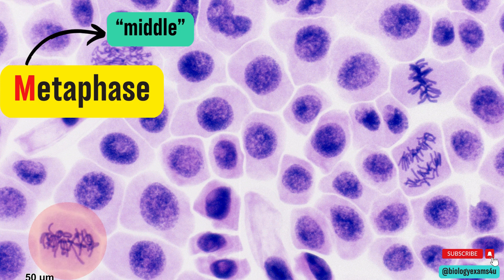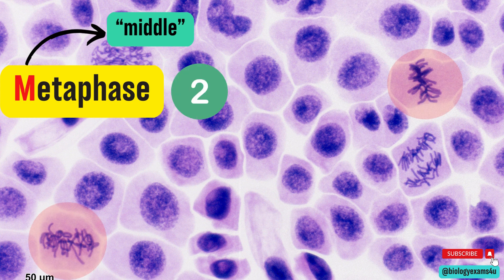So here is one metaphase cell, then here also. Here chromosomal strands are very clearly aligned at the center forming a clear metaphase plate. So the total number of cells in metaphase is two.